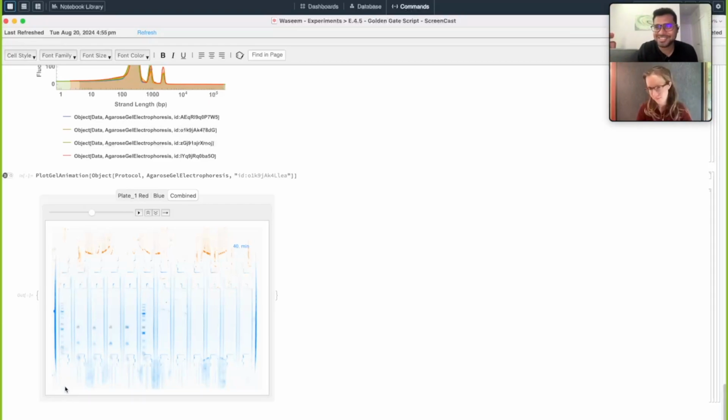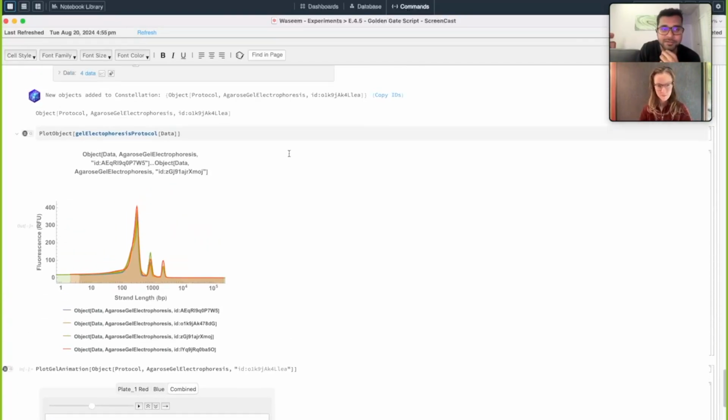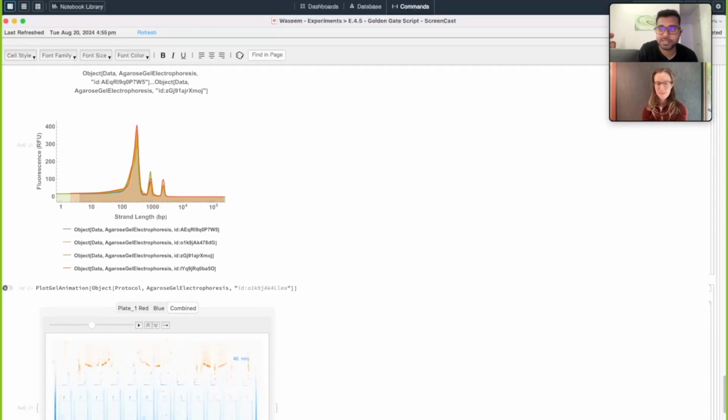So the graph above is a digitization of this, right? Yes, it's just a fluorescence reading digitization of that. And they have calculated these values based on the loading dyes themselves. So the x-axis base pair values are calculated based on the loading dye size and the ladder that is run along with the gel.